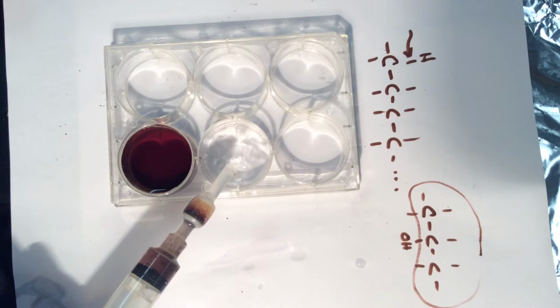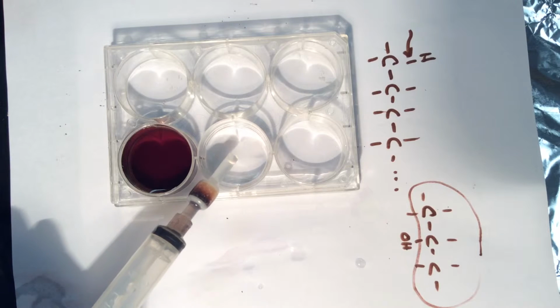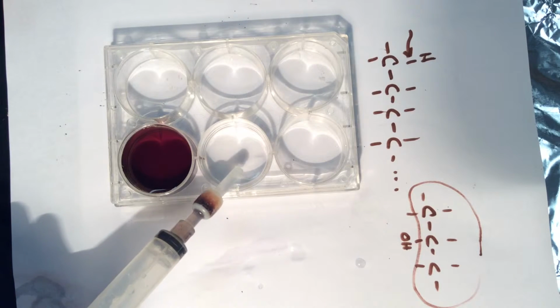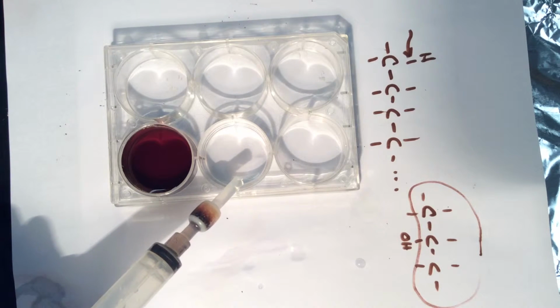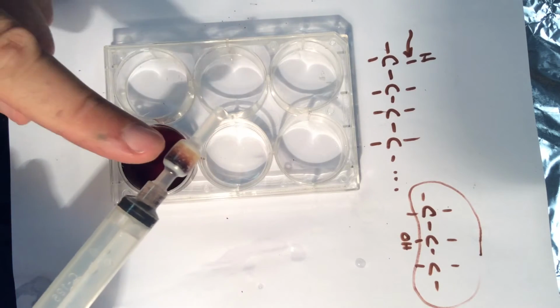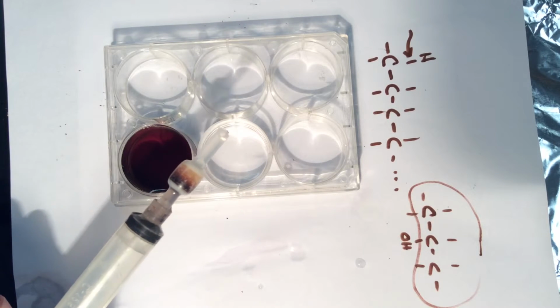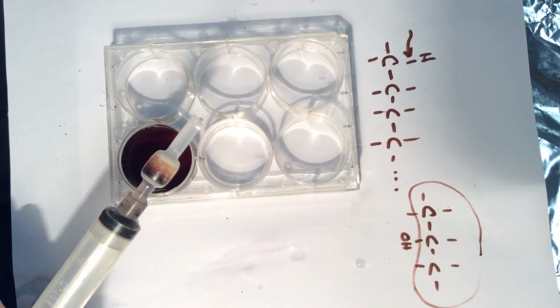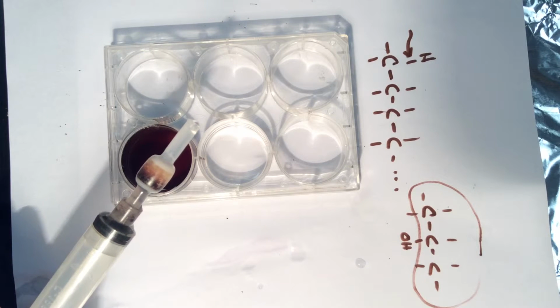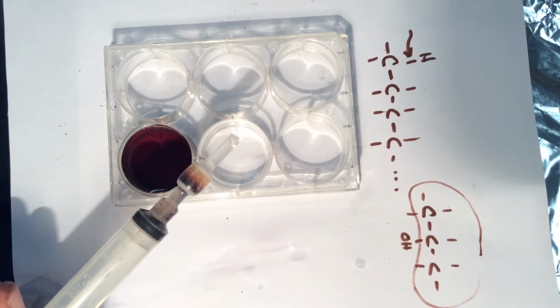What's collecting in the cartridge, the C18 cartridge? The dye. What color is it? Purple. What was the color of the liquid that came out? Right, so I separated the water from this mixture, and the dye preferred the C18 column. Why? Because the dye has stronger non-polar characteristics than it does polar. Even though we say it's water soluble, clearly it preferred the non-polar.